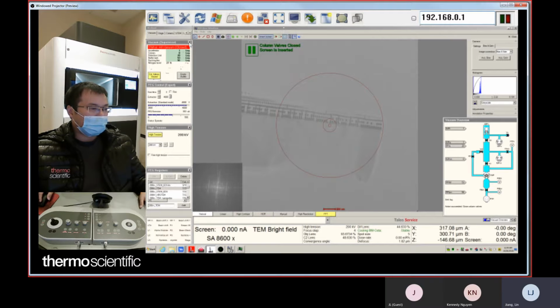If you go up here, you can go to settings and change your unit to Pascal. Usually for the log, this unit is easy to remember. For the accelerator, it's always around one.